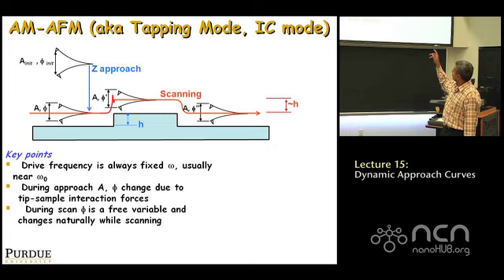And as you scan a sample, what the controller tries to do is move the base of the cantilever, whose locus is shown in red, up and down in order to keep the observed amplitude constant. So it uses the amplitude signal as a controlled feedback, scanning over the sample. In principle, as you scan over the sample, when you hit an edge, as shown here, the controller is going to have some transients.